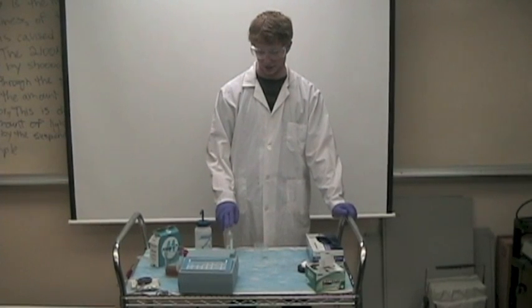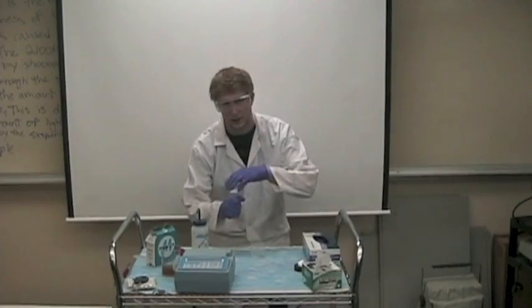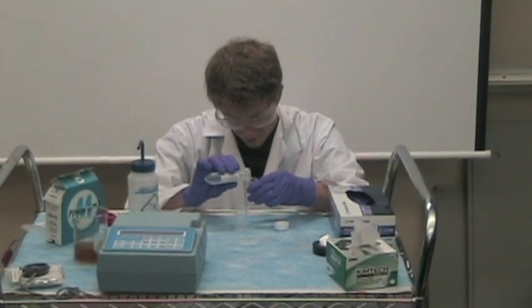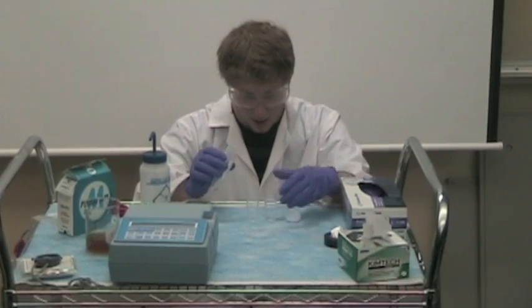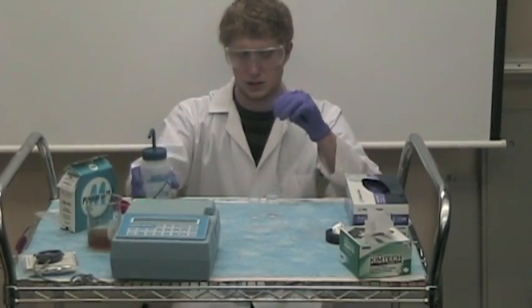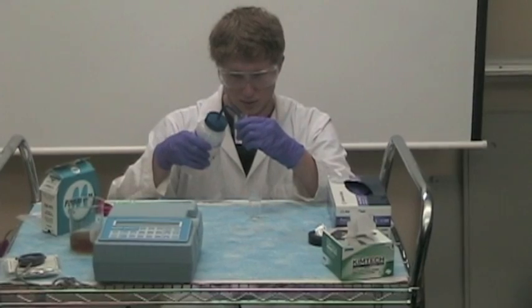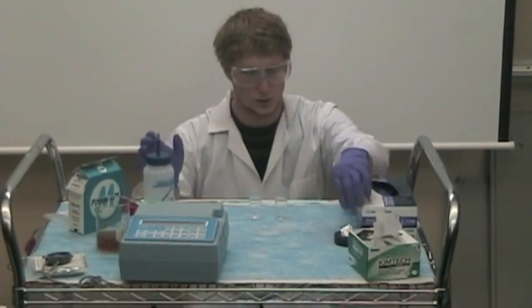Next, we will add our distilled water and sample water to our cuvettes, followed by pillow packets in each one, and covered by parafilm. We'll add the water to 25 milliliters, which will be labeled on the cuvette. After that, we will shake for 3 minutes to speed up the reaction.